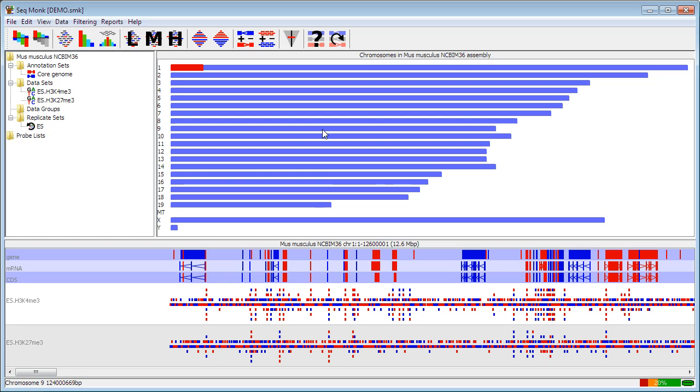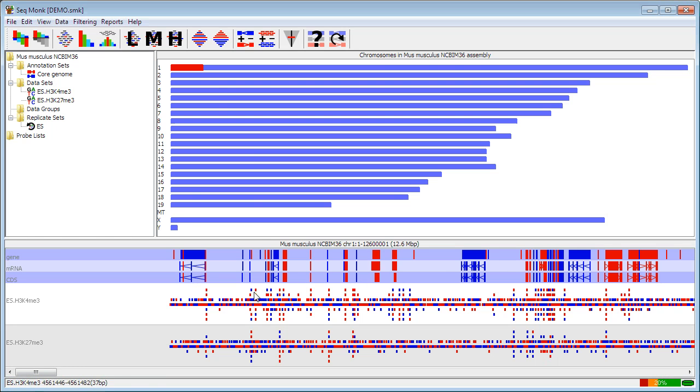On the right hand side at the top I have a view of the entire genome where I can see all of the different chromosomes. There is also a red box and the red box tells me which part of the genome I am currently viewing in the bottom part of the display which is the chromosome view which is a track based genome browser.